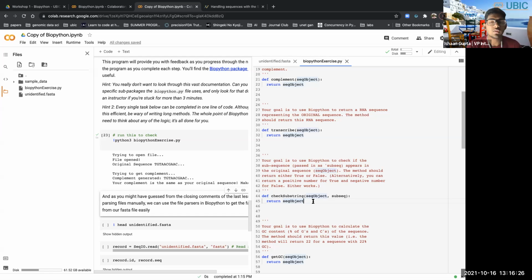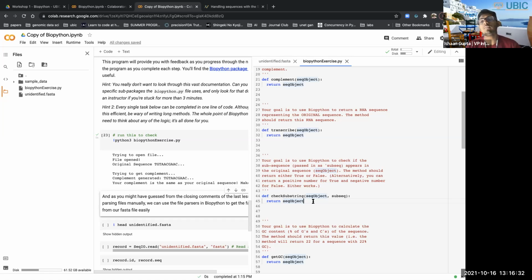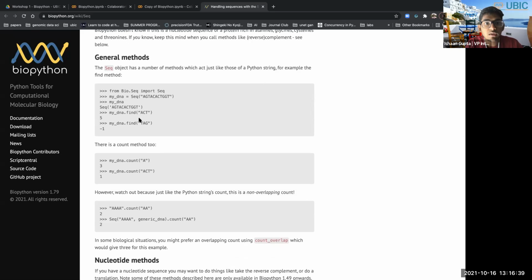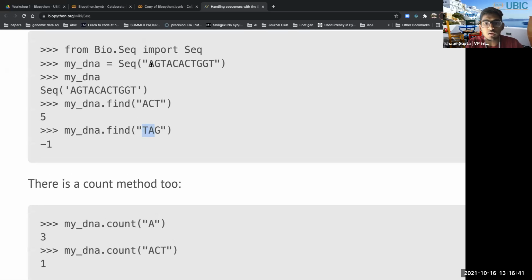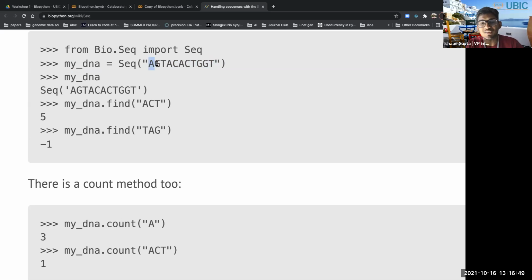Great question. So -1 is actually, well, what do you think? Shouldn't the documentation say something like that? Right, you're right. TAG is not in this file, right? Oh, no, wait, I get a point. T and then A and G, right?